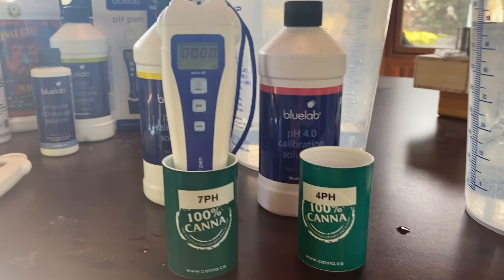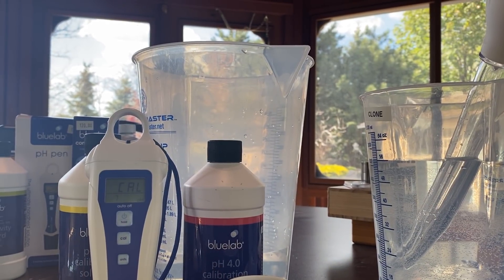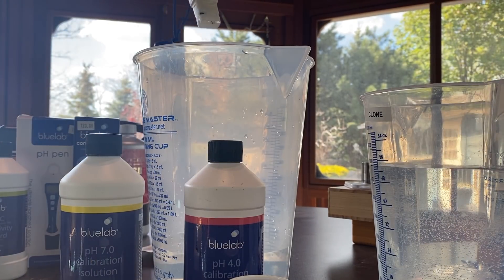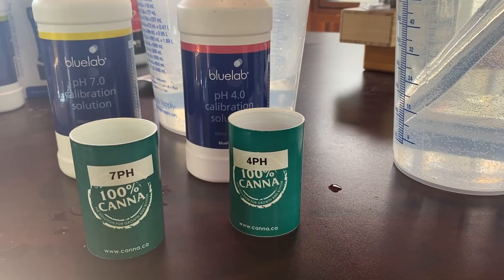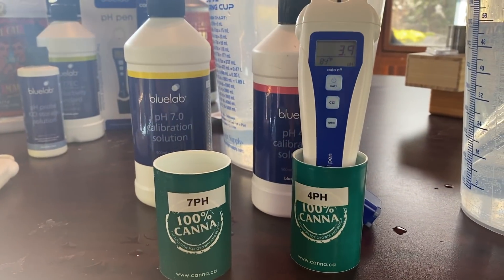When that's over, we're gonna go ahead and rinse off the tip of the pen with some tap water. Now we'll put it into the 4 pH solution — it may take a second before it gets down there.